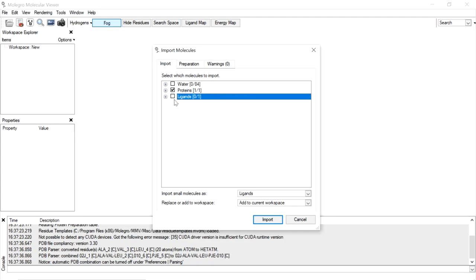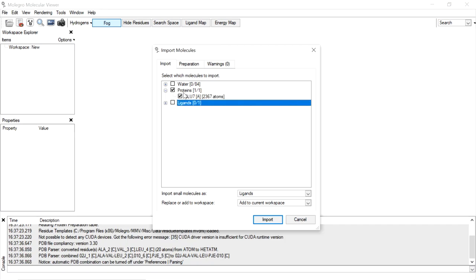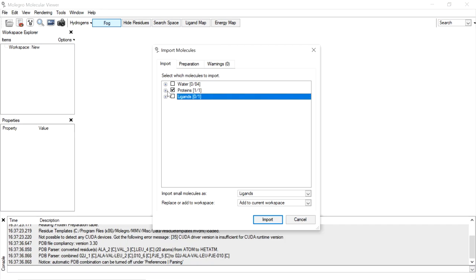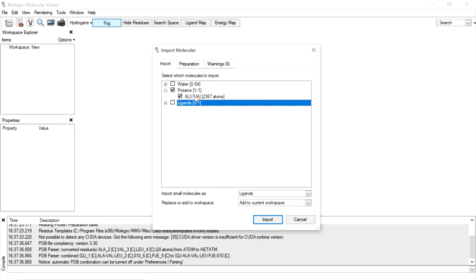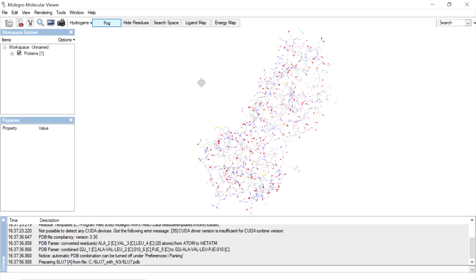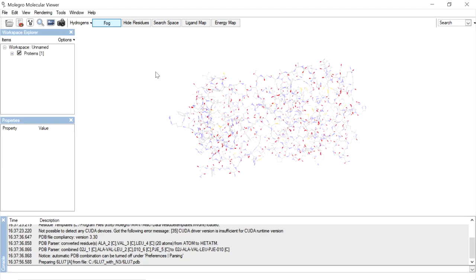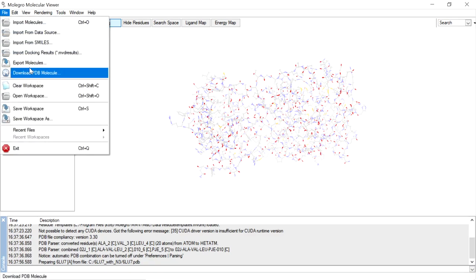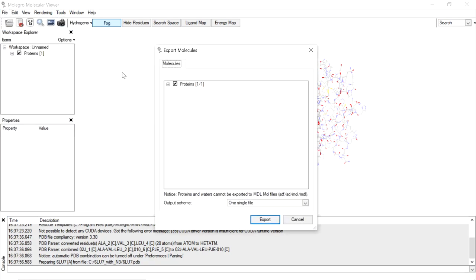We need only the protein. This protein has only one chain, so we are going to import it. The protein is now imported successfully in the workspace. It does not have water molecules, ligands, or any other cofactors. We are going to export the molecule.